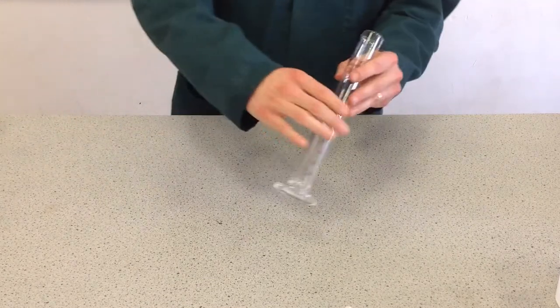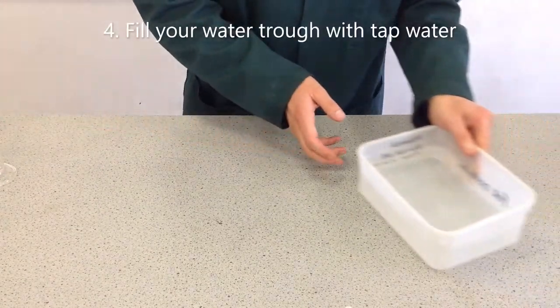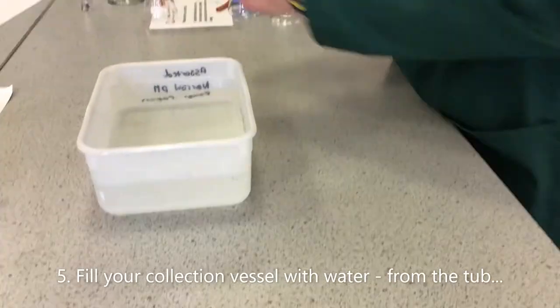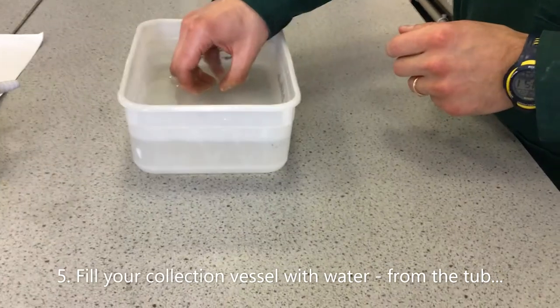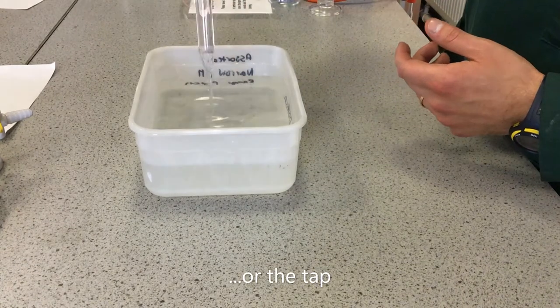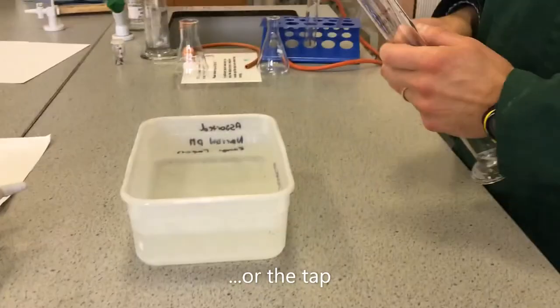Once you've decided on your reaction vessel and your collection vessel, we need to position the collection vessel. I'm going to use one of these measuring cylinders. You need a tub of water, about half full — this is just tap water — and this is where you're going to put your measuring cylinder in. If using a test tube, I can fill it directly from the water in the tub by tilting it upwards slightly, so there are no air bubbles. However, this tub is too small to fill the measuring cylinder that way, so I fill it from the tap.